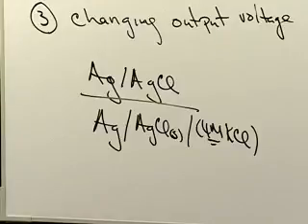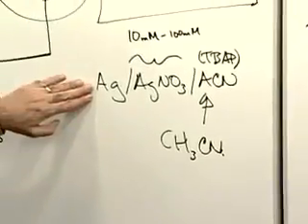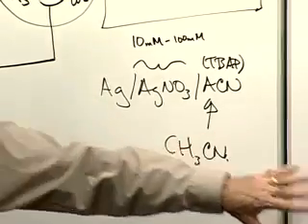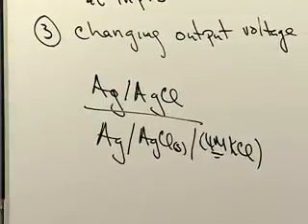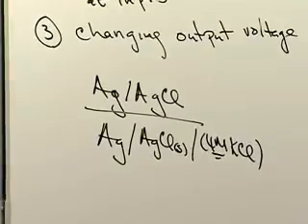Of course, this one's easy also, but again, if drifting is your issue, I'm not sure this is your solution. This is easy to make, but it does drift somewhat on you. And again, I would define drifting as changes that are bigger than 10 millivolts, since I don't think your potentiostat can read better than 10 millivolts. So if it's shifted 2 millivolts today, I don't think that's an issue. But tens of millivolts is an issue.